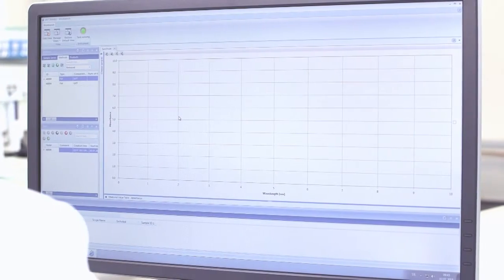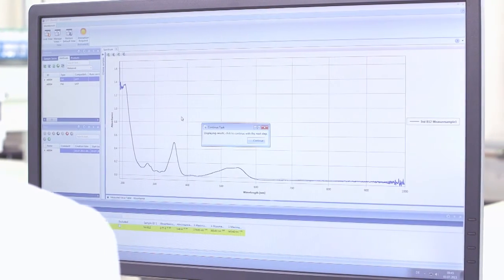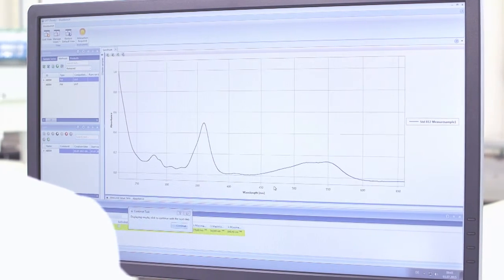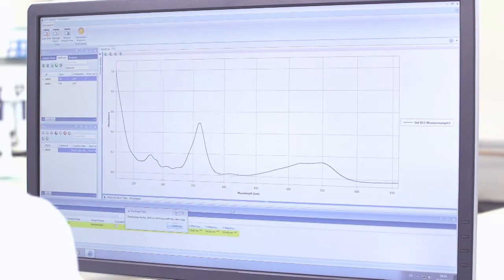LabX UVVis PC software allows you to work at either the instrument's terminal or at a PC. The PC does not need to be close to the instrument if bench space is limited.